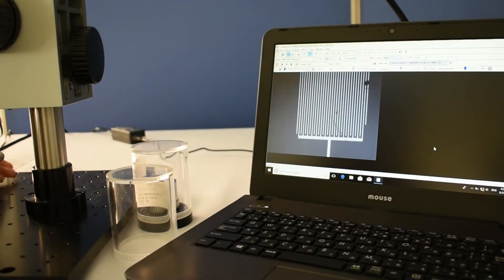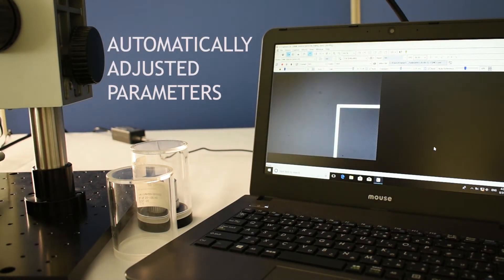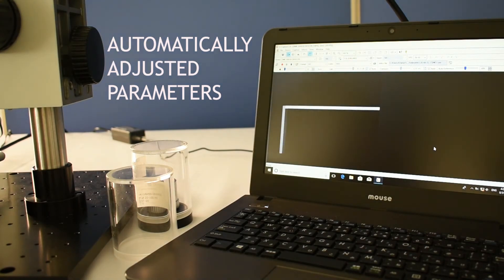Provided with the camera, this software allows for automatic adjustment of multiple parameters such as the gain and the luminosity.